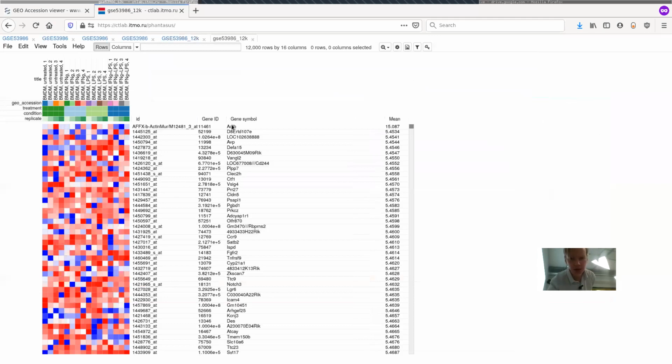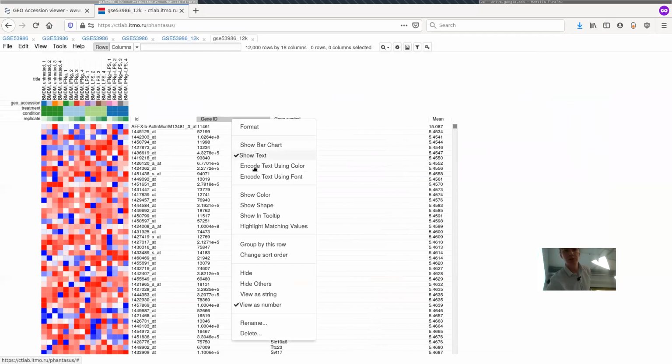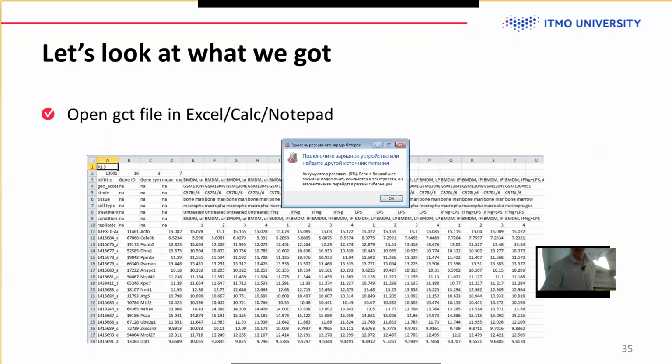We are starting, but more or less. Okay, it more or less worked. So we have the same dataset. Sorry, my laptop also needed a few minutes' break.